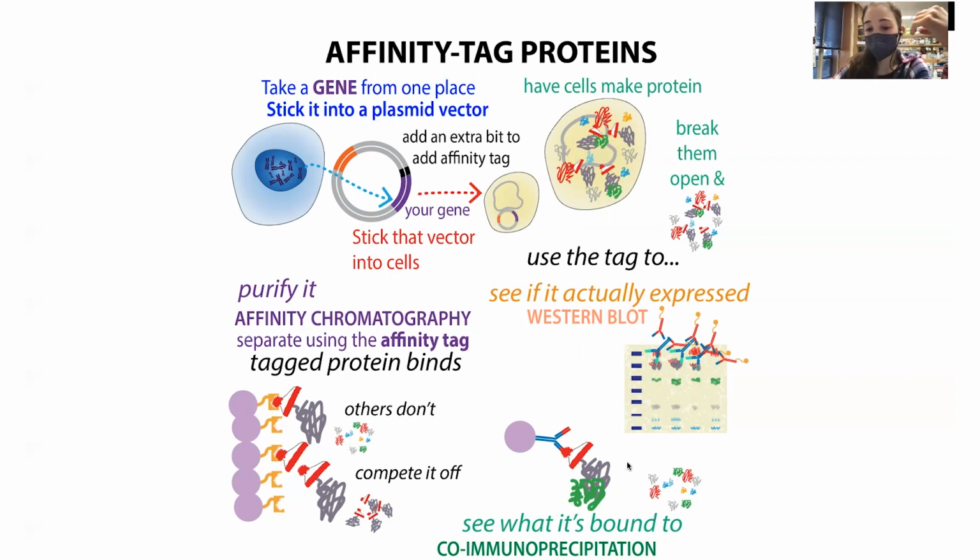Because you can imagine that if you had a multi-protein complex, you pull out your protein of interest, but it's bound to something that's bound to something else. And you do the mass spec, unless you wash this super thoroughly, in which case you might wash off the actual direct binding partner, you're not going to be able to tell if these were directly linked to one another, or if they were just nearby, just pulled out alongside what was directly bound.